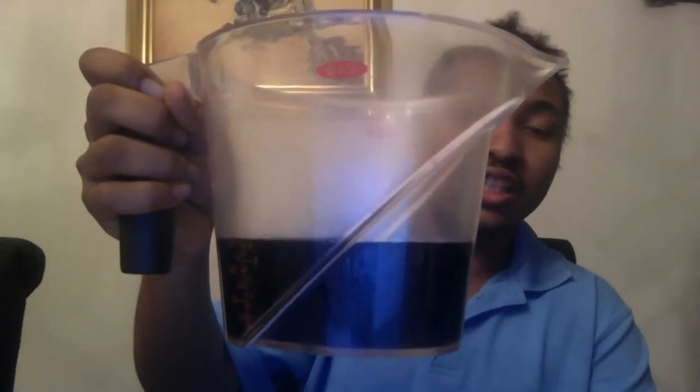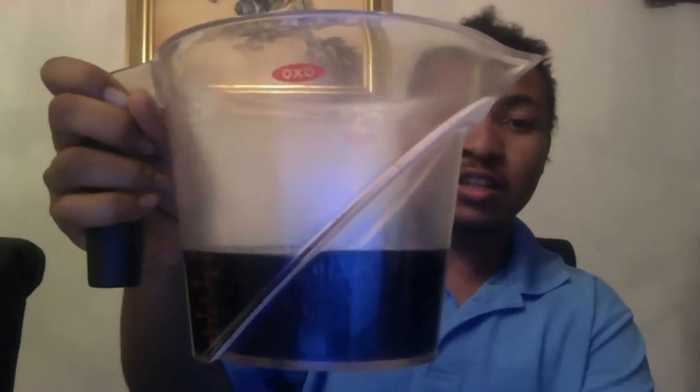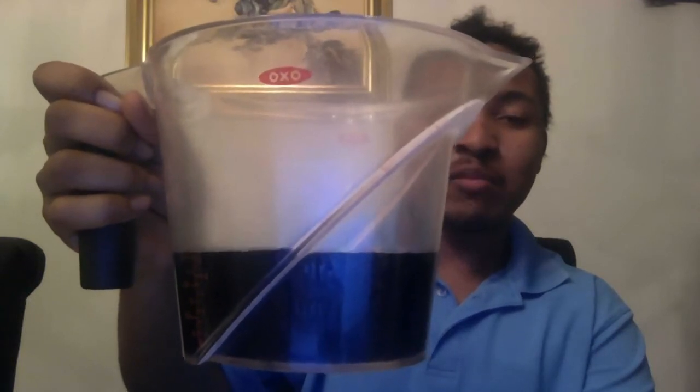And I'd like to show you my results and the way that the picture turned out. This was initially clear, but now it's a dark blue/black color after pictures A and B were mixed together, which had two different solutions. To make the experiment even more accurate for other people in the future, I think that the type of vitamin C that would be specified would make a huge difference, even though it was mentioned that we should not use vitamin C that's chewable or for children. I still think that recommending a specific brand instead would definitely improve the results of the experiment for others.